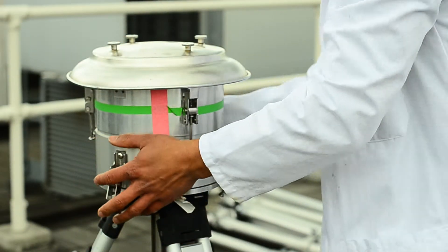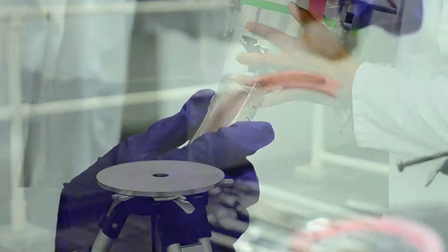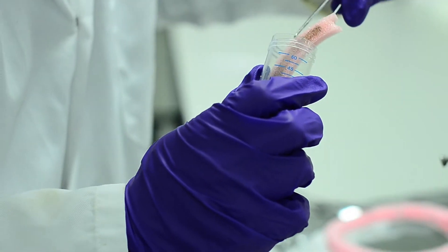This second machine filters air at a much higher rate and this is to be used in conjunction with the pollen counting. We take apart the different sections of the machine and replace filters daily.